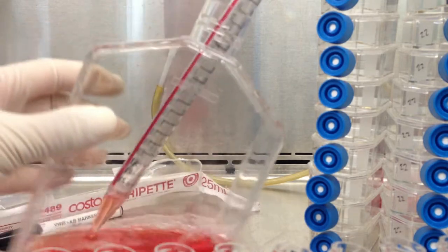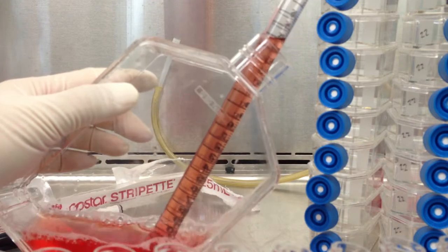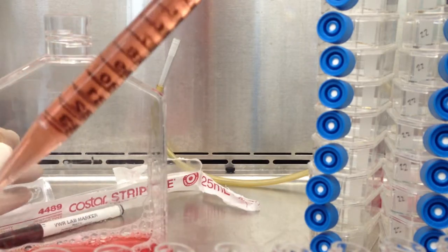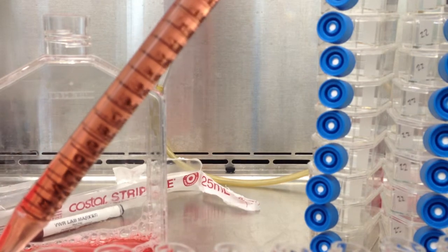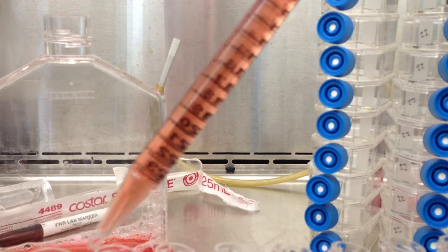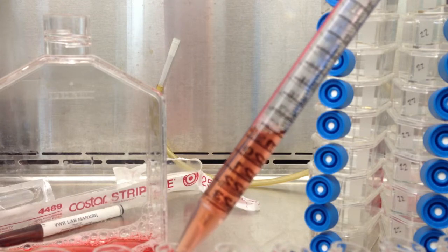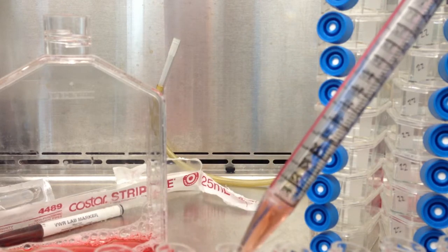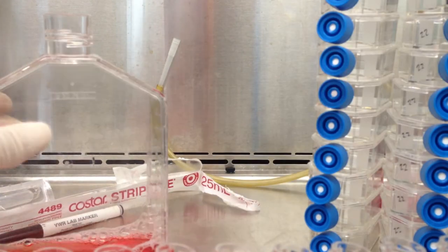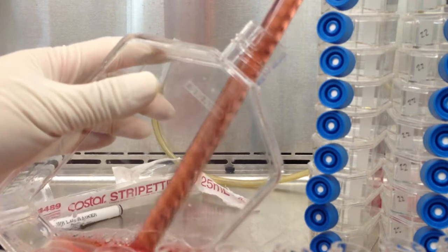It might be hard to see simply because the camera is not at a good angle. So this is 10, I'll take 25, and the pipette is not properly attached, it's a bit harder. And just rapidly dispense 5. You don't need to be so careful about the meniscus, because as long as you're consistent in how and where you dispense compared to the line, you will dispense roughly the same amount.